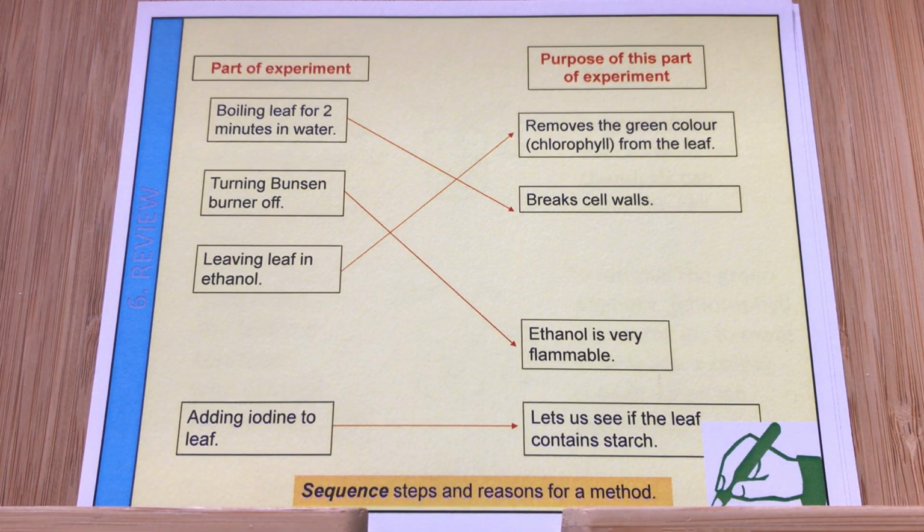Now the leaf that was in the dark, it hasn't photosynthesized, so it's needed to break down that starch reserve and use it as glucose. And we think of this as like a midnight feast. So the iodine solution, when you add it to the leaf that's been in the dark, does not change colour, it stays that orange colour.